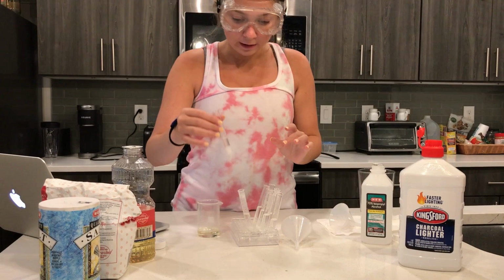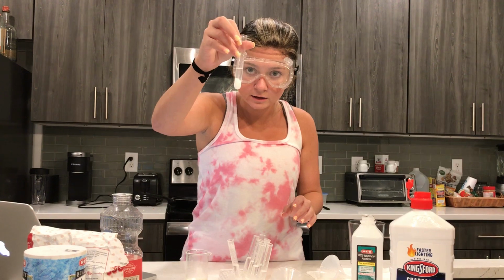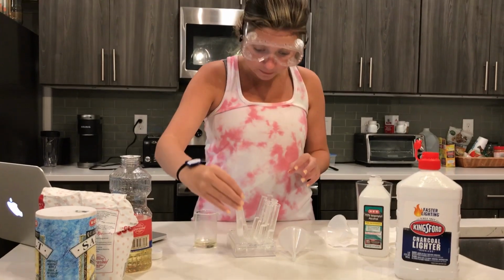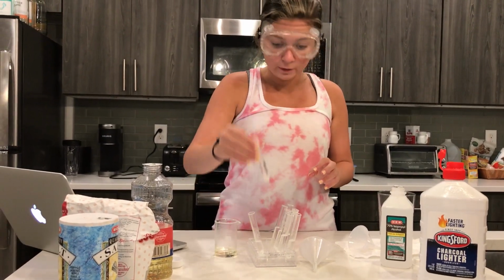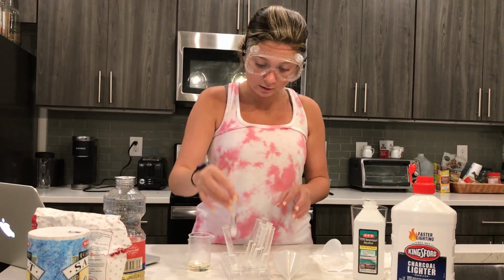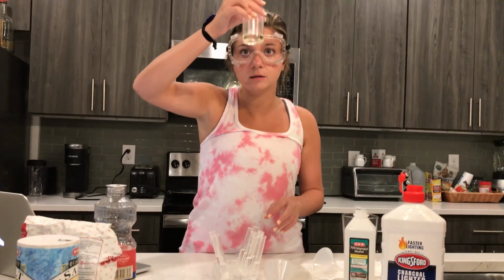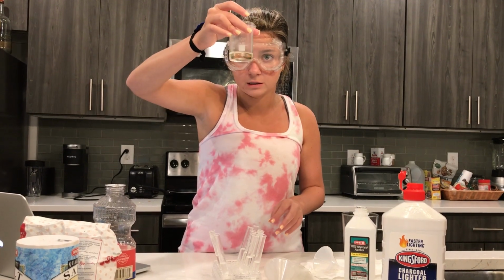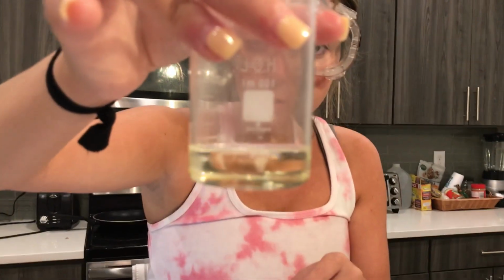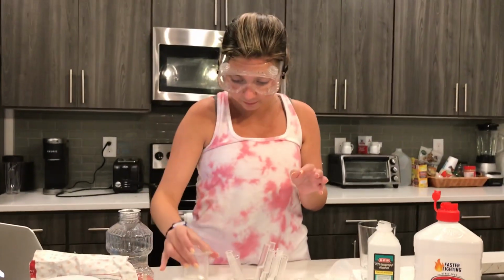And lastly for this row we have oil and the alcohol, which there is a line separating the two. And then for this row we have salt and lighter fluid, and it looks like it's at the bottom, so I would say no mixture there. And then lighter fluid and sugar still just looks like it's sitting at the bottom, just not a lot of mixing happening. And then lastly we have the oil and lighter fluid, which looks the most mixed out of all of them, but I feel like you can still kind of see a ring at the top where the lighter fluid is, and then the oil looks like it's at the bottom. So yeah.